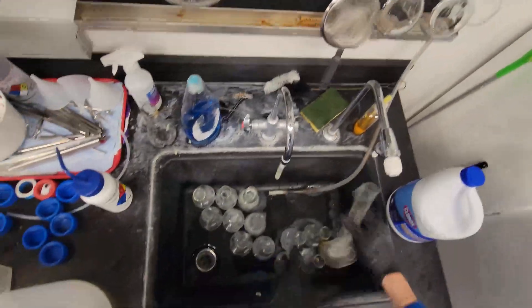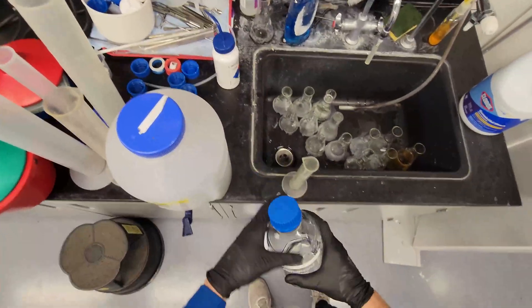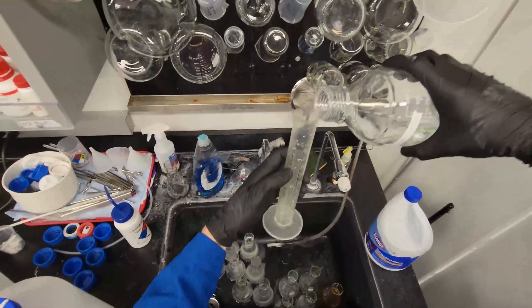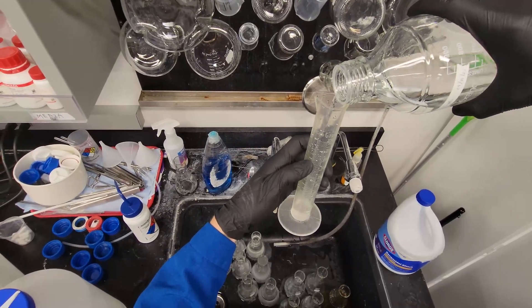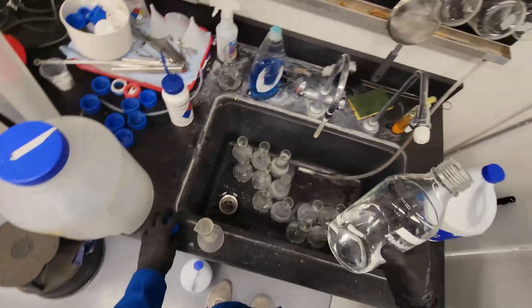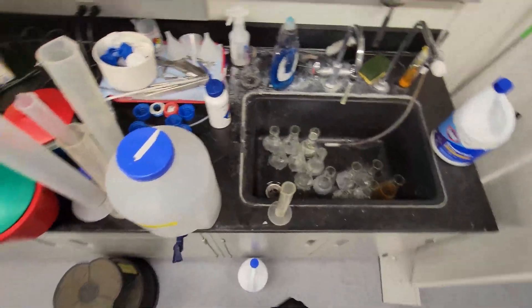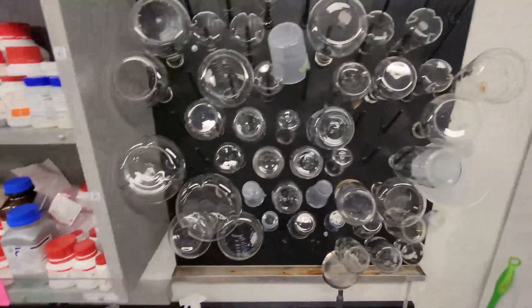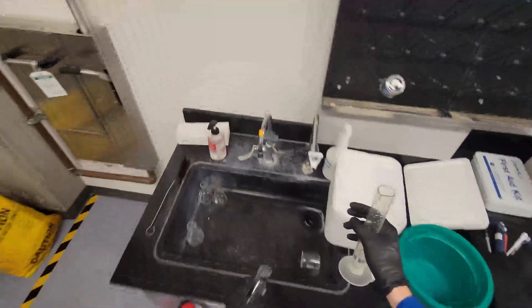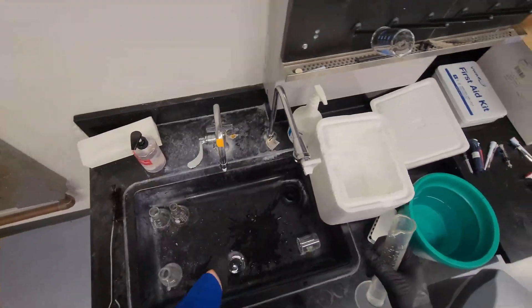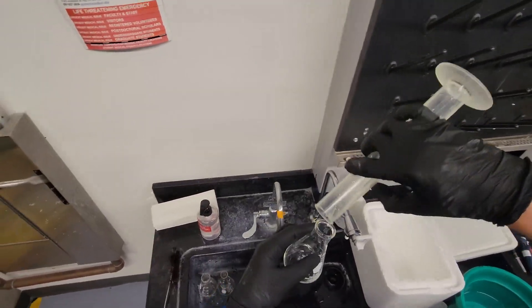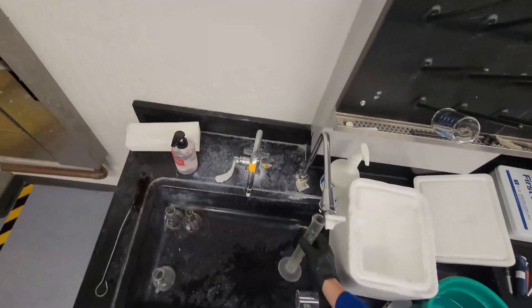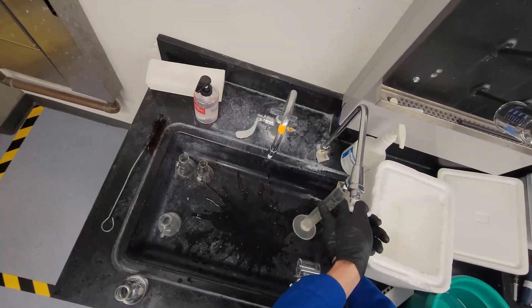There it is. All right. I'm going to rinse this out. I'm going to do 25 mils of this. Approximate, as always. And I want to use one of these little buddies. I'll rinse them out. Abundance of caution. Here's the Z-Buffer going in. I'll rinse this out, too. Let me put it back. It's just salt and stuff, so nothing crazy.